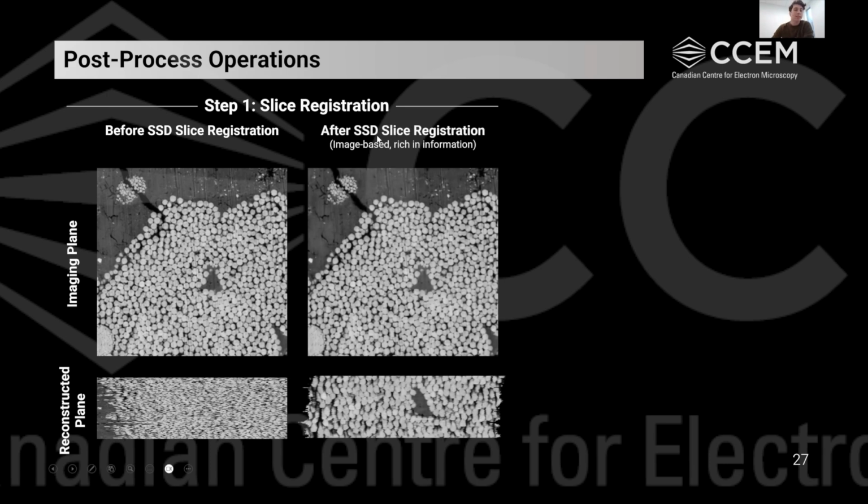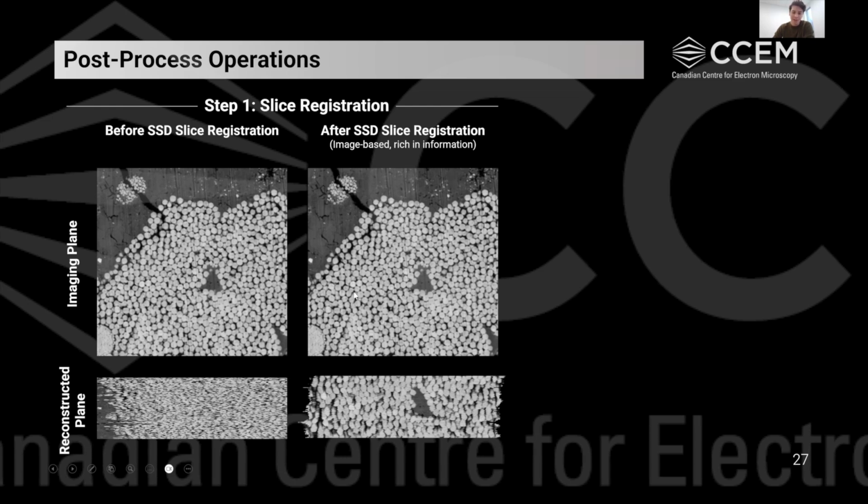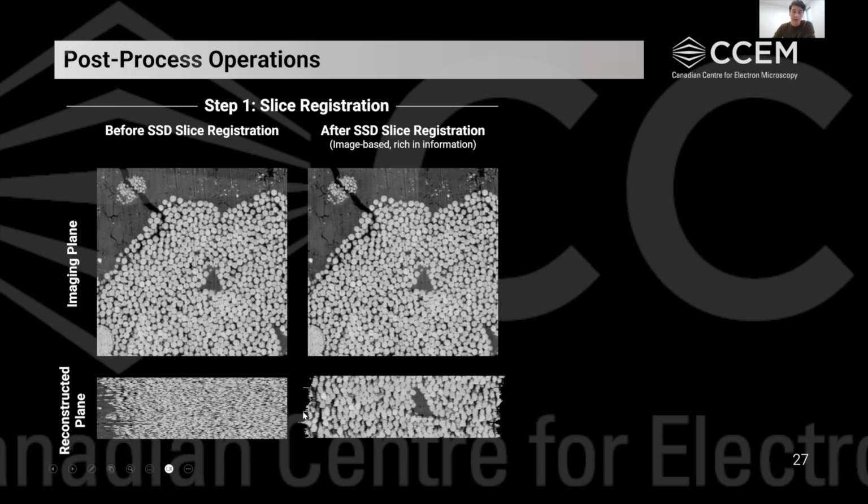So if I apply an SSD slice registration algorithm, again, an image matching based algorithm, based on the information common in all these slices, we can see that our reconstructed plane is now much more rich in features. We can actually see that these spheres are present in 3D. We can see that this dark shape in the middle is persisting in the XZ and YZ planes as well. And if we look closely on the edges of this reconstruction, we can actually see how much each slice has shifted in the XY position in that slice registration stage of post-processing.